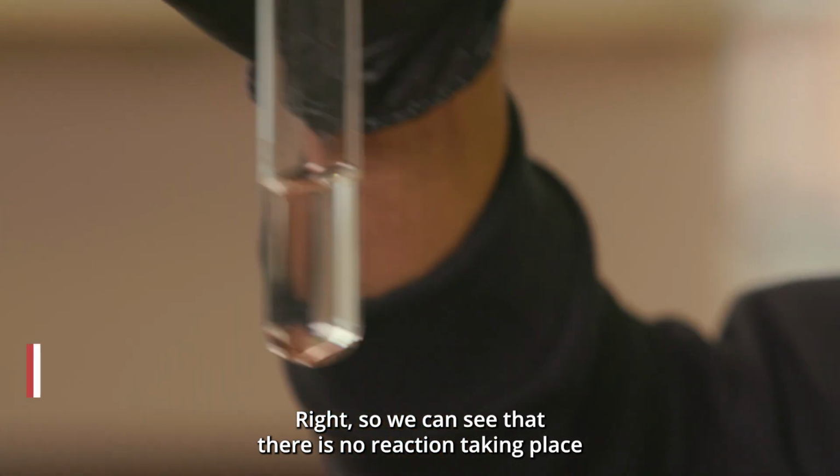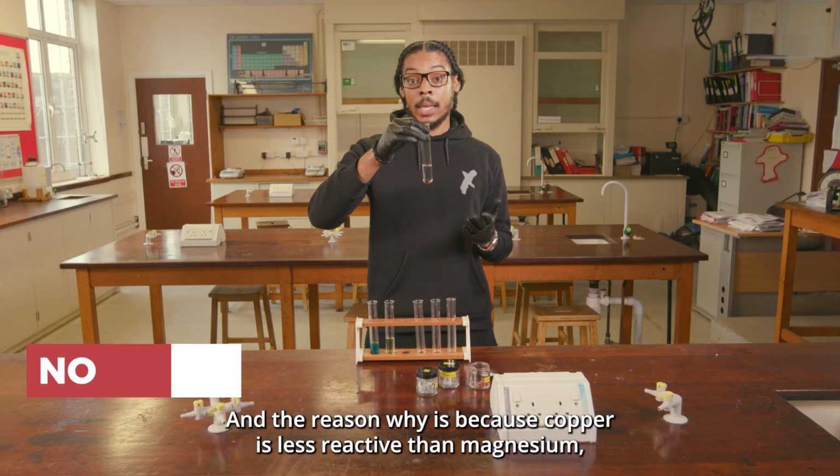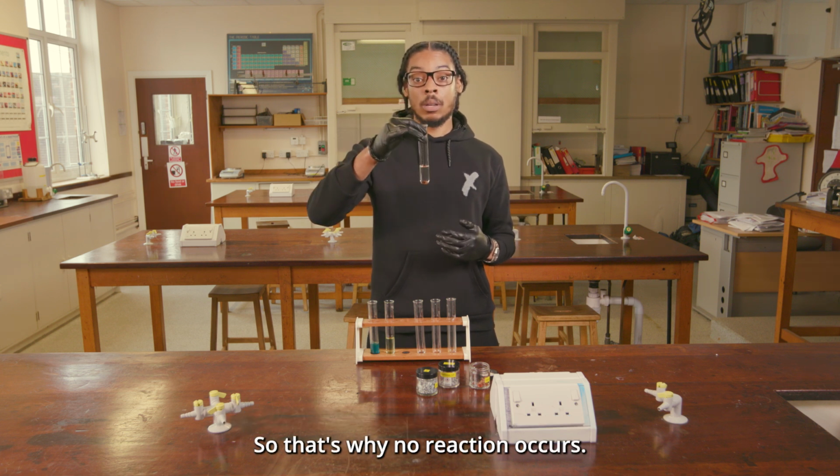Right, so we can see that there is no reaction taking place between the magnesium sulfate and the copper metal. And the reason why is because copper is less reactive than magnesium, so it's unable to displace the magnesium in magnesium sulfate, so that's why no reaction occurs.